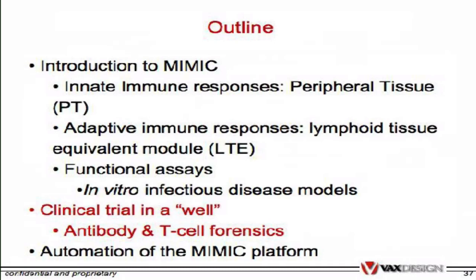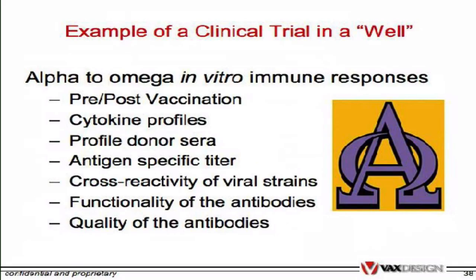Have we done a clinical trial in a test tube? I really think we're close. Obviously, we don't have a human that we're putting in a test tube, but we have the functional components of the immune system that, at least in our hands, seem to recapitulate what happens in vivo to a high degree. I just wanted to give you some example of how we could do a clinical trial in a test tube.